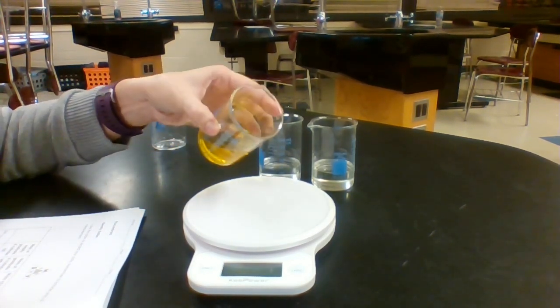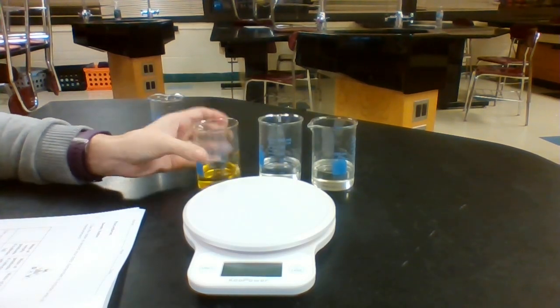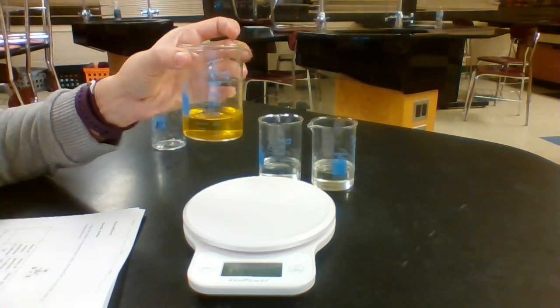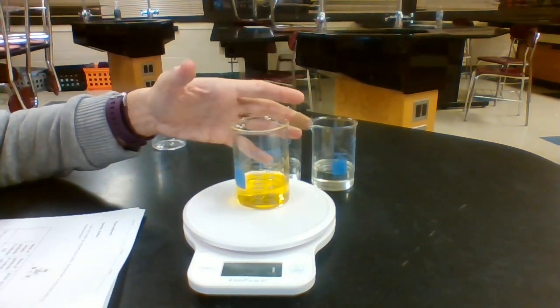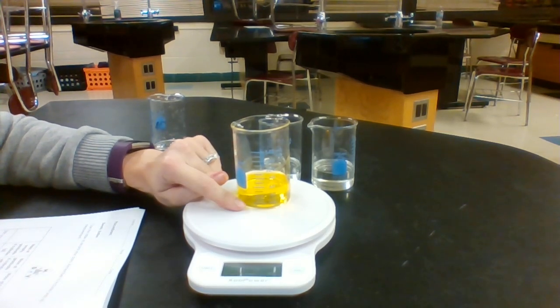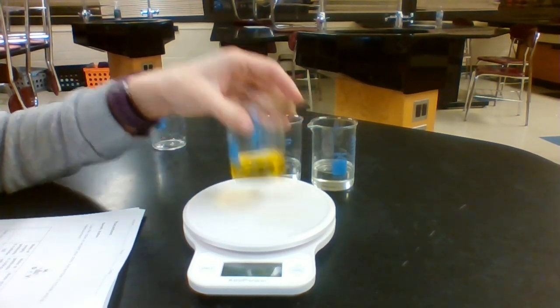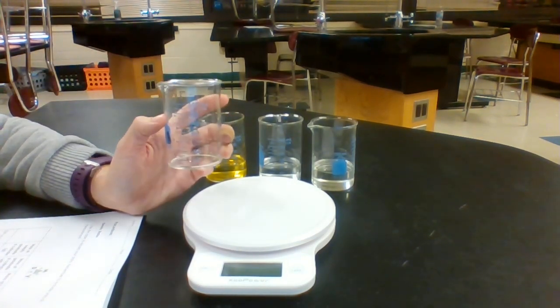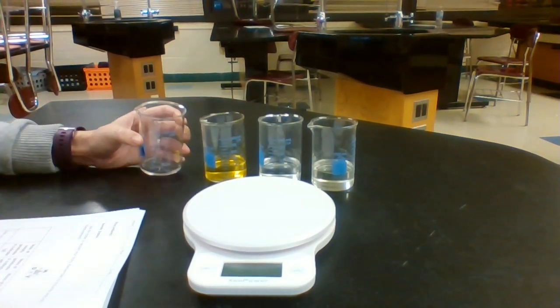However, I can't just pour the liquid onto the scale because it would run off. What I need to do is set the liquid and the container on the scale. But that means that I would get the mass of the container and the liquid and not the liquid by itself. So what I have to do is find the mass of an empty container. These are the same containers.